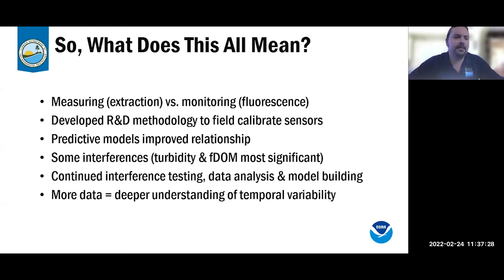And then finally, data with low temporal resolution is often very difficult to interpret. By supplementing our current discrete sampling efforts with high frequency chlorophyll monitoring, we deliver greater insight into our dynamic estuarine system.